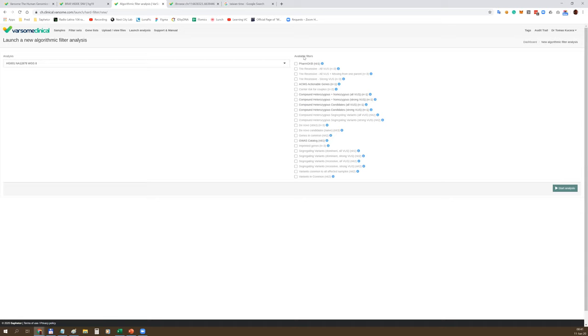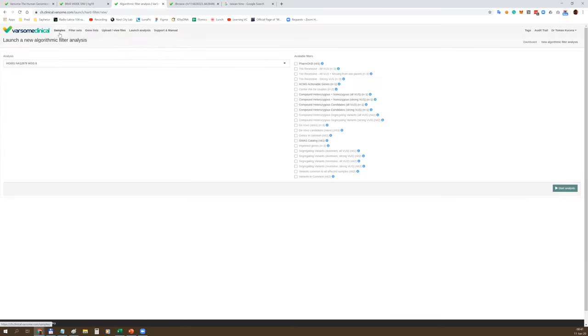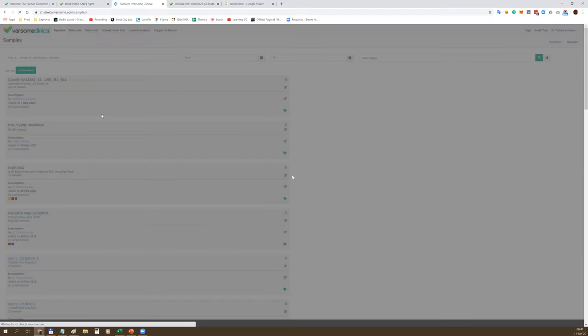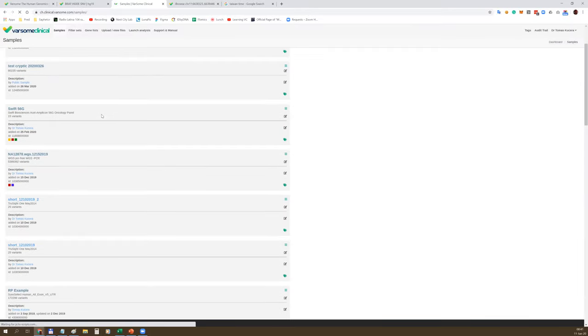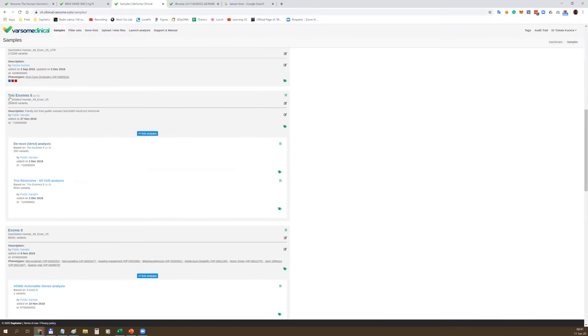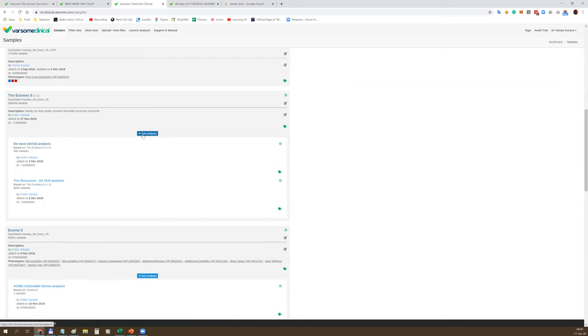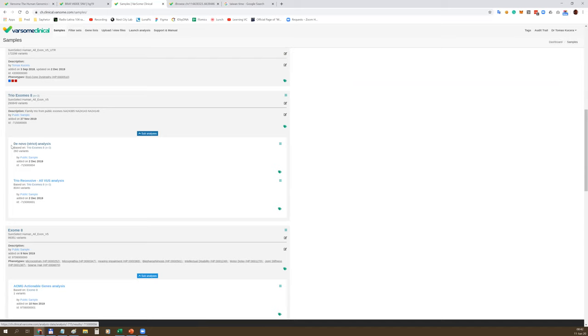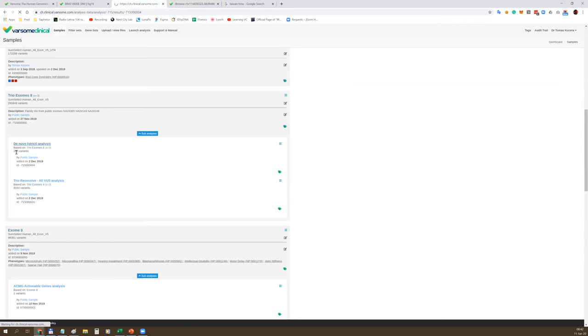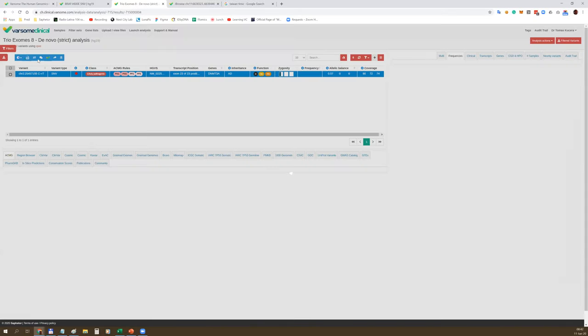Algorithmic filters are basically little programs we develop specifically for every customer according to your specific needs and workflows. Here you can see several common examples. With algorithmic filters, you can filter out compound heterozygous variants, perform segregation analysis for multiple samples, extended families or cohorts, call de novo variants in trios, or perform carrier risk for couples. The important thing is that these algorithmic filters can be fully customized according to your needs.